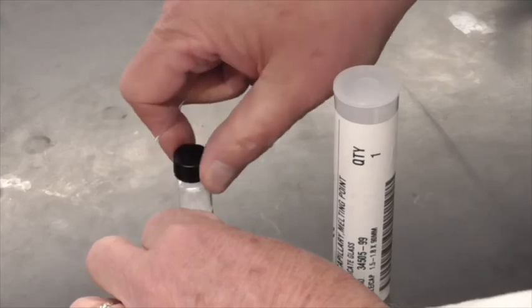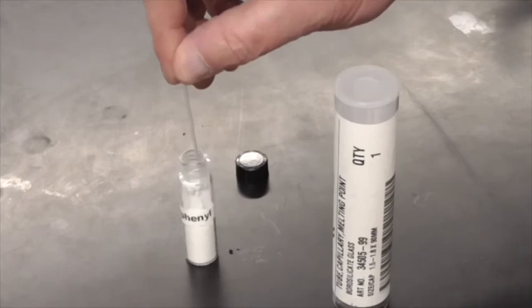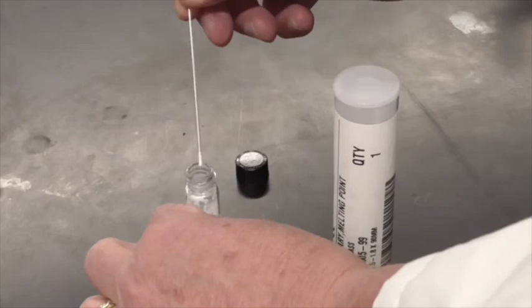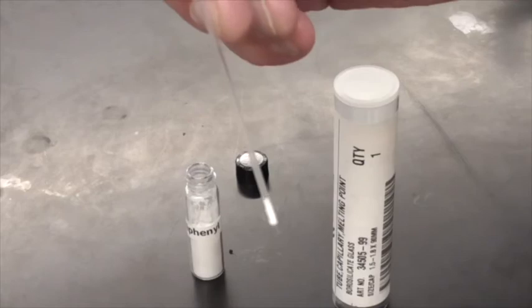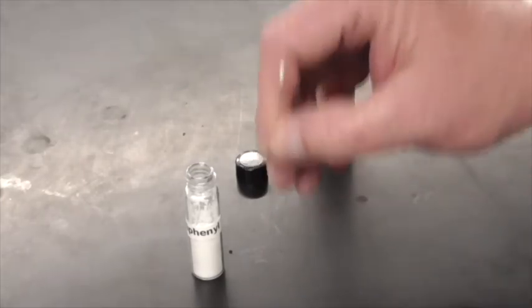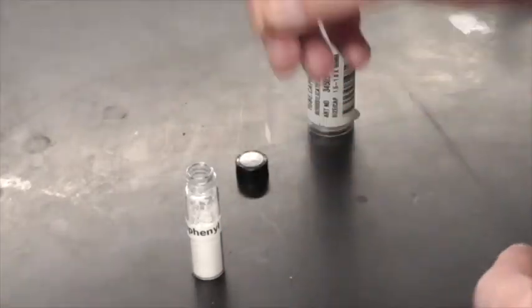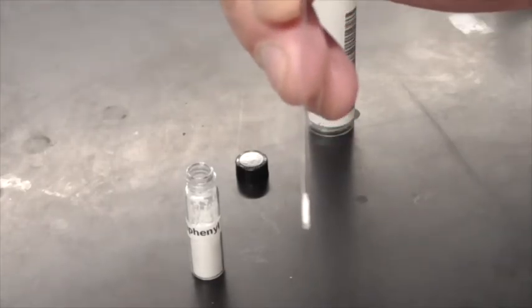So if I open up the biphenyl and just kind of smash down the tube into the biphenyl, we can see that there's some of the white powder in the end of the tube. Now I'm just going to flip the tube over because I want the biphenyl in the closed end of the tube. I'm just going to tap it on the countertop. Okay, and what you'll see now is that the biphenyl is now at the bottom of the tube.